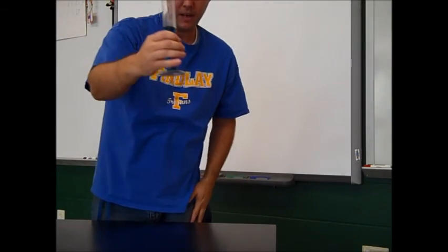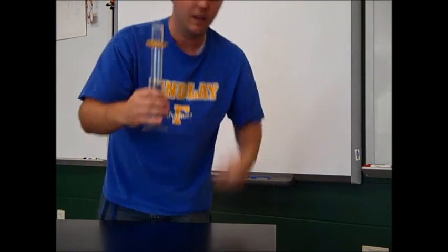Number two, you need to always read it at eye level. What you don't want to do is pick it up like this and try to read it, because reading it like this is going to give you a different angle. If you're sitting down and looking up at it, it's going to give you a false reading. If you're standing up and you try to read it, you're looking down on it. So again, it's got to be on a flat surface all the time.